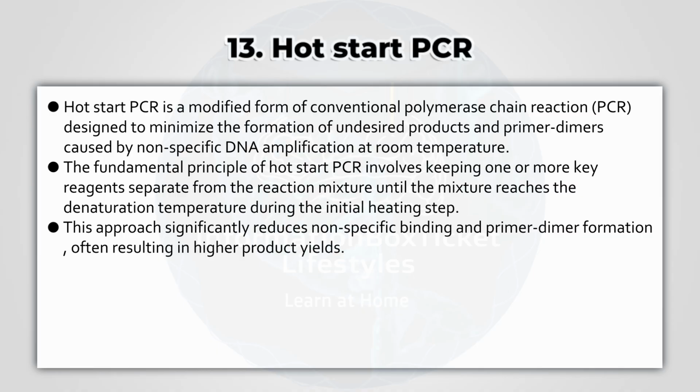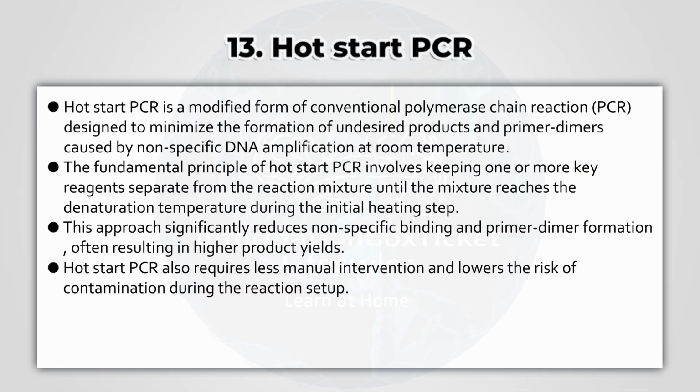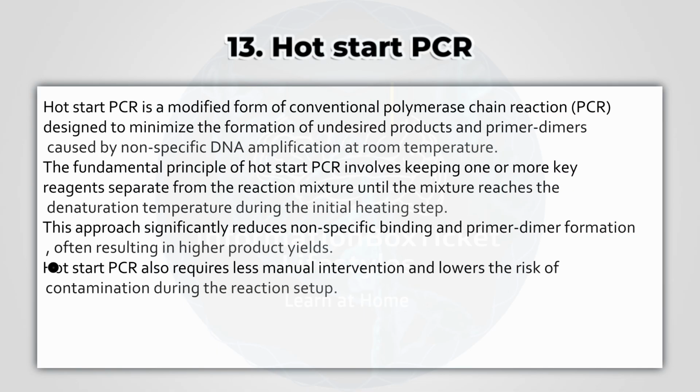This approach significantly reduces nonspecific binding and primer-dimer formation, often resulting in higher product yields. Hot start PCR also requires less manual intervention and lowers the risk of contamination during the reaction setup.